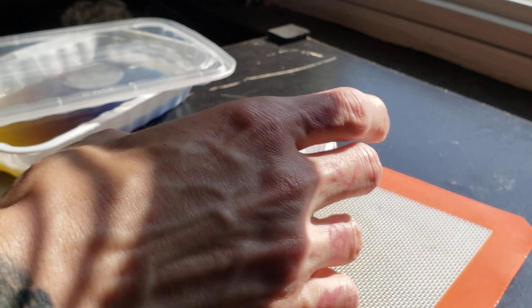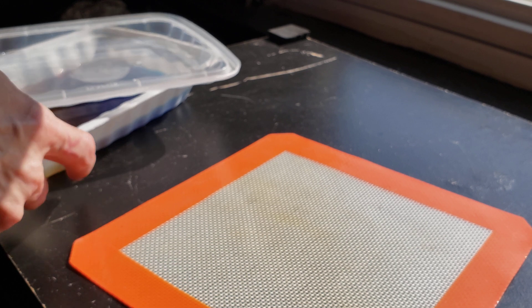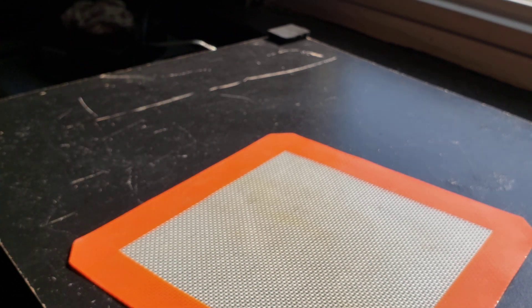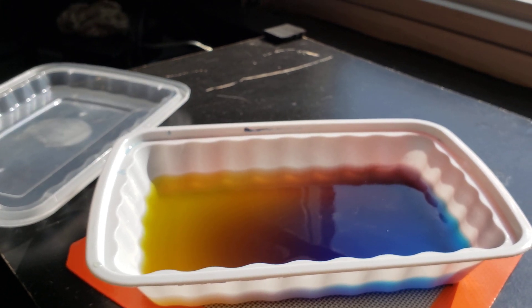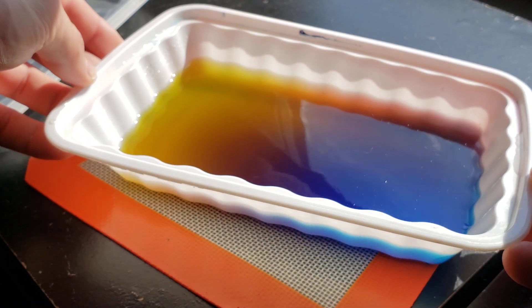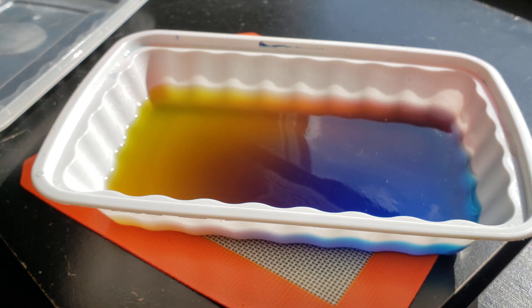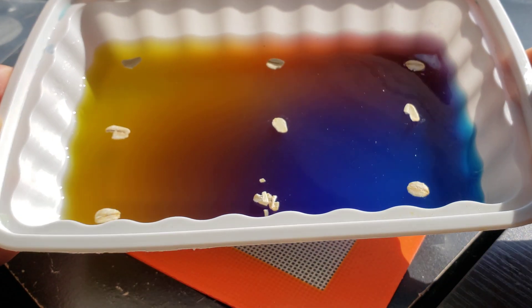The next one is actually kind of interesting. I got agar again but this one is colored, and we're going to see if there's a preference in which direction it goes color-wise. Let me go ahead and spread out some oatmeal on there across all the different colors and then we'll get started. All right, there we have it.